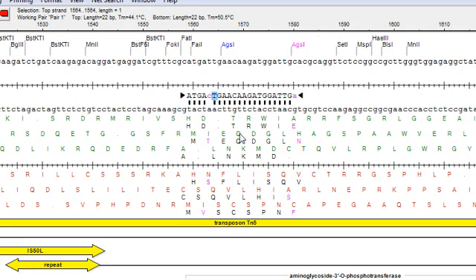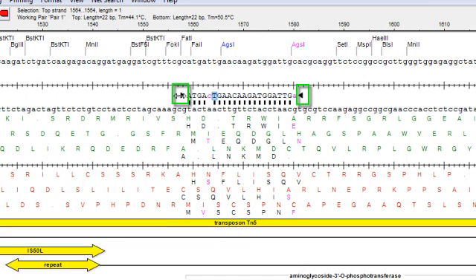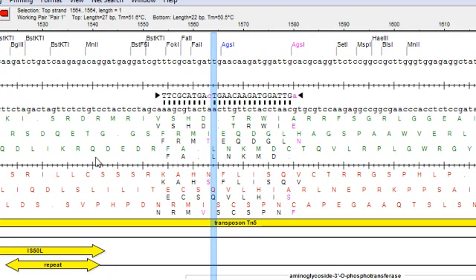Now, the other way you can edit while in selection mode is to change the primer length. And you can do that by grabbing one of these handles on the ends of the primer and just drag it in either direction.